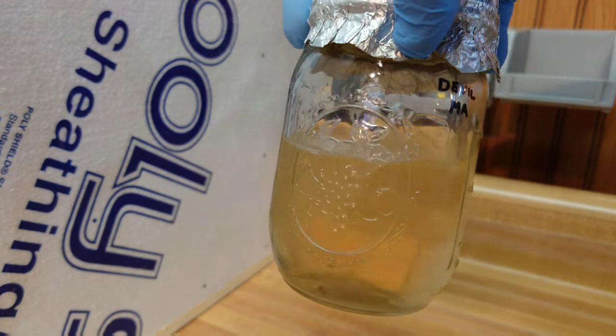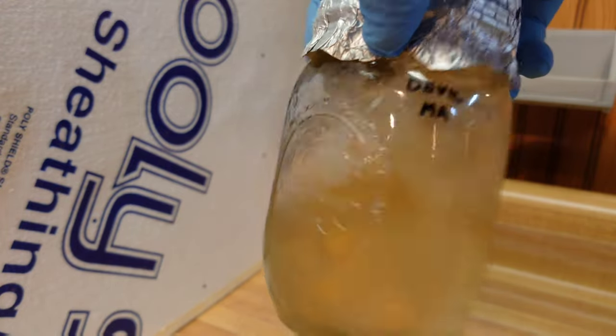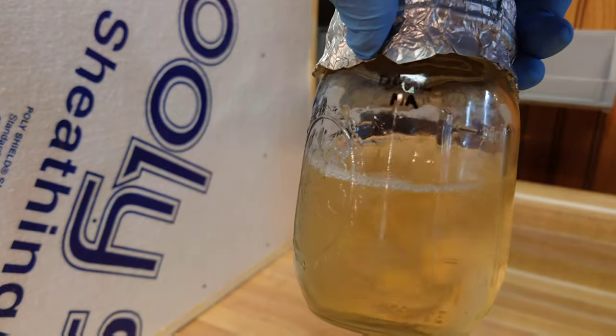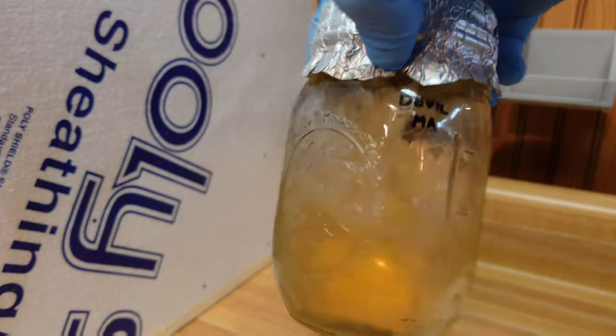Here's our morel culture that we pulled from the grain jar. You can see the broth is nice and clear, and we've got some really nice chunky morel mycelium in there. So that one's looking good too.